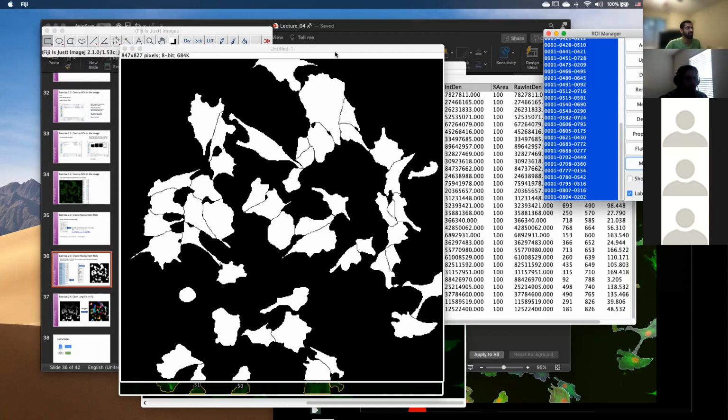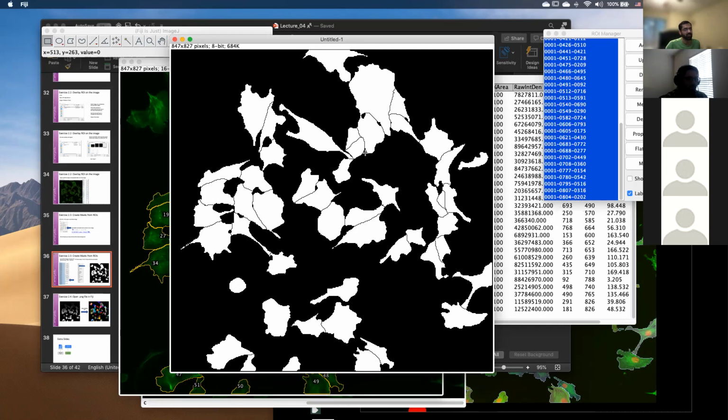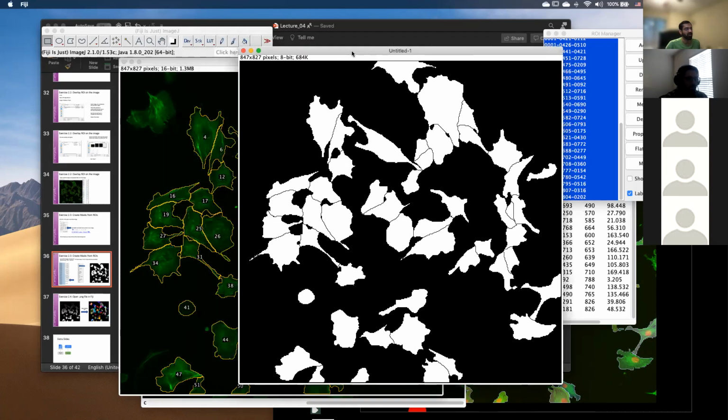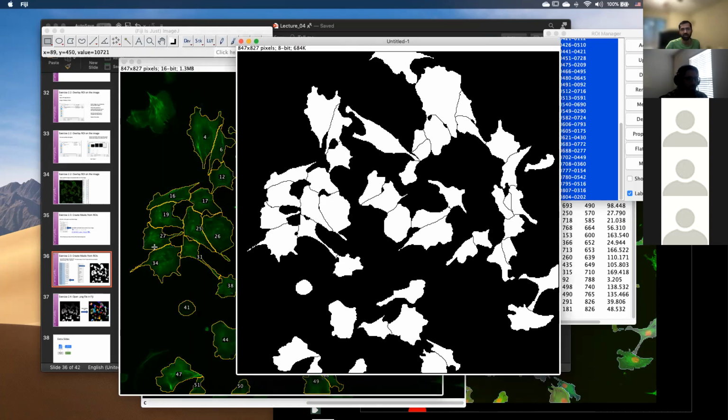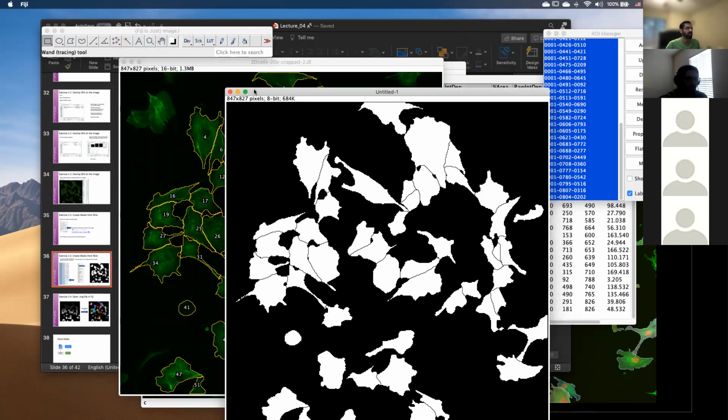Yeah. Okay. And if you're wondering why we care about this right now, you can just save these files, but this is something which will be helpful to us next week. And if you remember from last time, you can do image math based off of this. So if you generate masks off of nuclei, you can do image math where you subtract the nuclei from this, and you only get the region which is cytoplasm and not the whole cell. And these are the kind of things we will do next week. Gotcha. Thanks. Okay. Yeah, you're welcome.